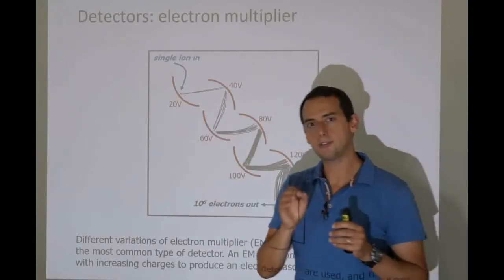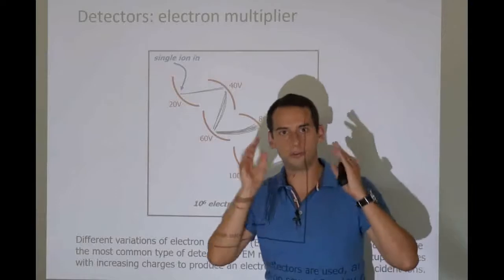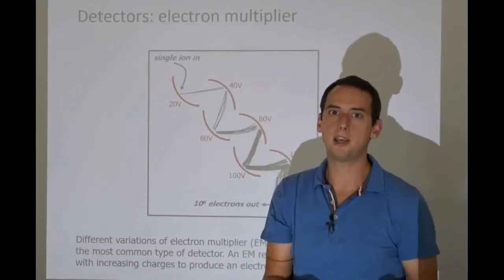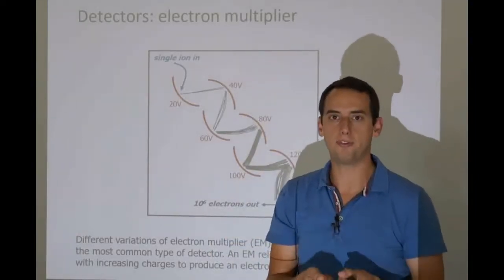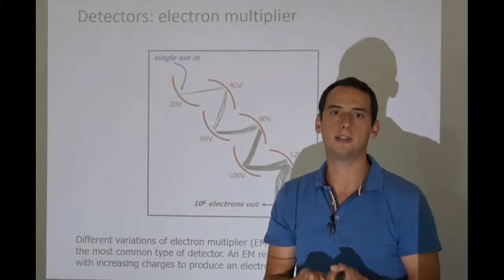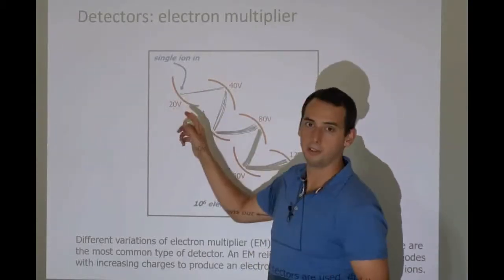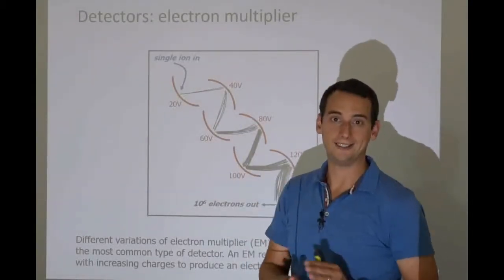Now, the ion sees this dynode, it's charged, and so it rushes towards it. We've seen this many times. By putting an electrical field, we can motivate ions to go in a certain direction to attain a certain kinetic energy, a certain velocity. Now, unfortunately, this is also where the story of our analyte ends.